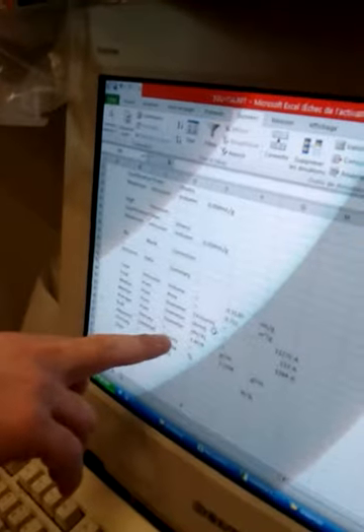We can show there that it's 2.5, and the density of silica is 2.6. So okay. It's close, so it's correct. Maybe we could reanalyze the powder sample with the pycnometer to have the real value, and maybe we can have a better estimation of porosity.